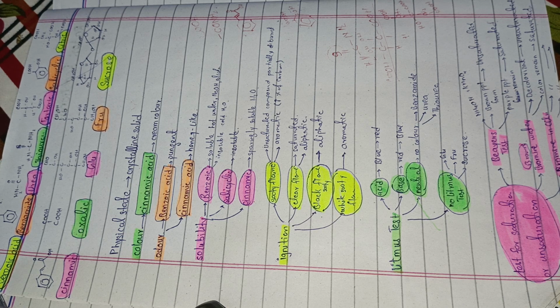Second is the odor of these compounds. Only two compounds have an odor, while all the other compounds are odorless. These two compounds are benzoic acid and cinnamic acid.